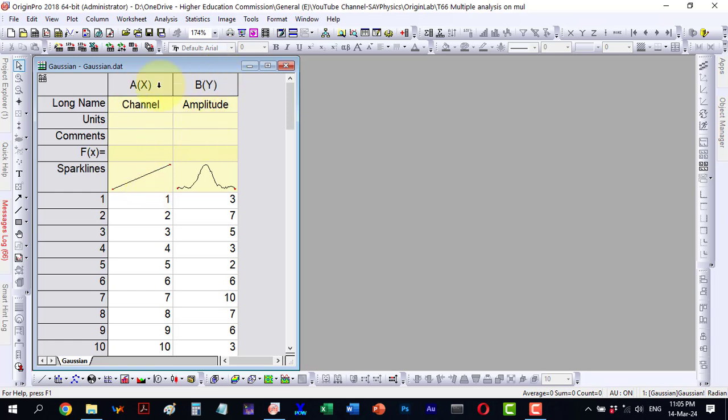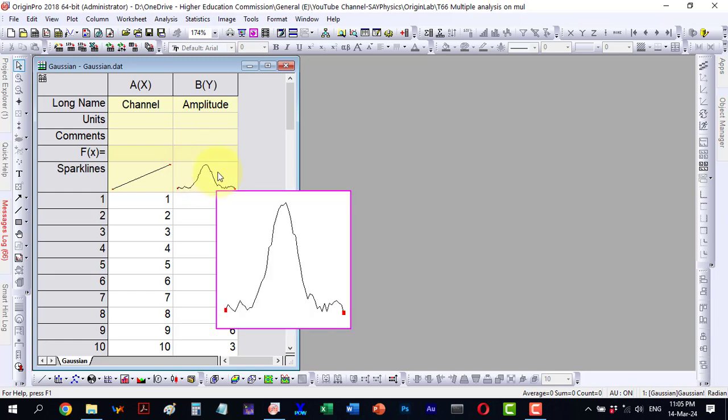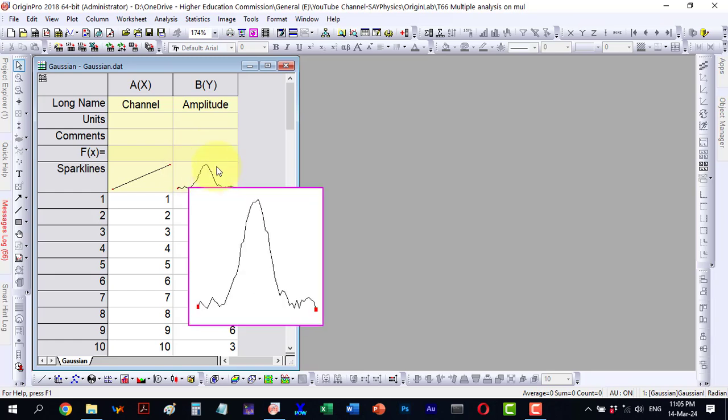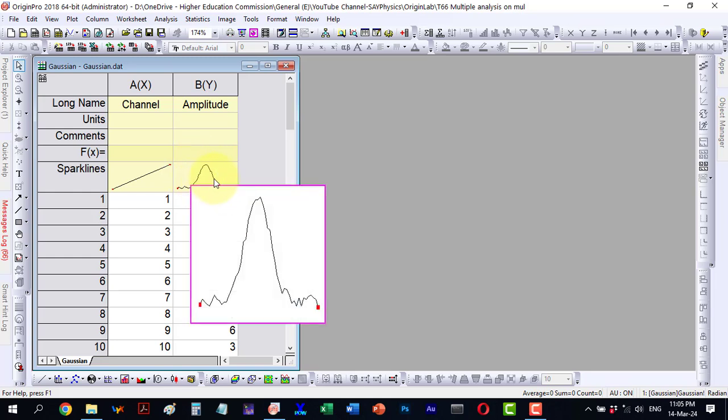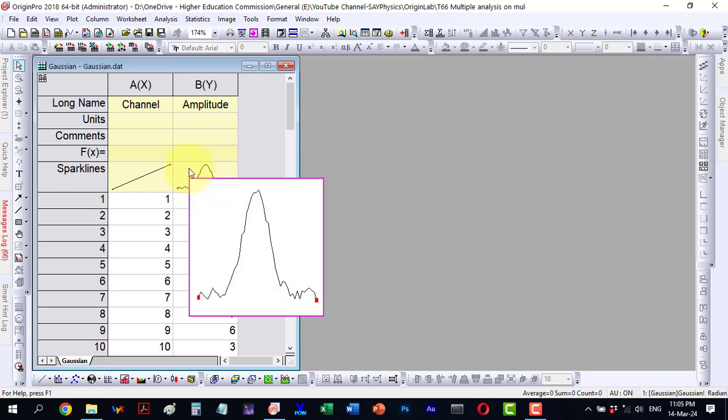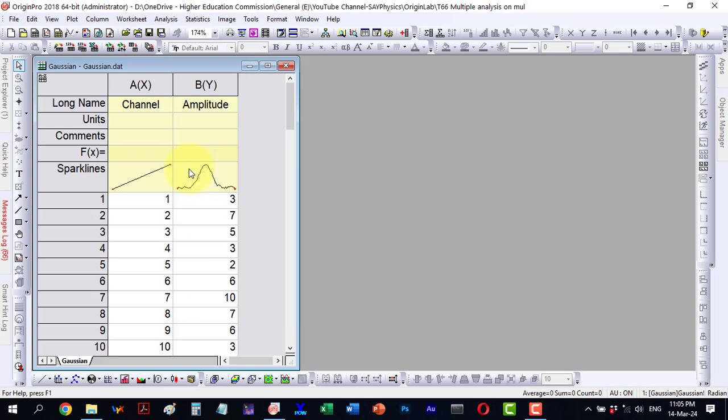Now what we will do is I have selected Gaussian type data and aim to conduct various fittings. We can choose from various analyses. I have opted to fit different functions to this data for a comparative analysis. I will apply four different functions to this data set.